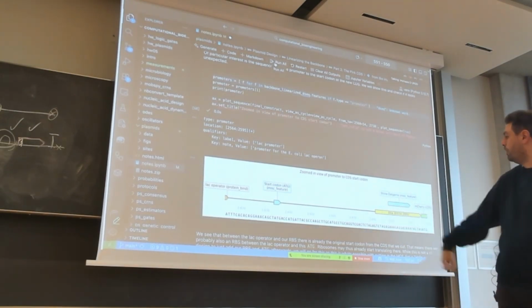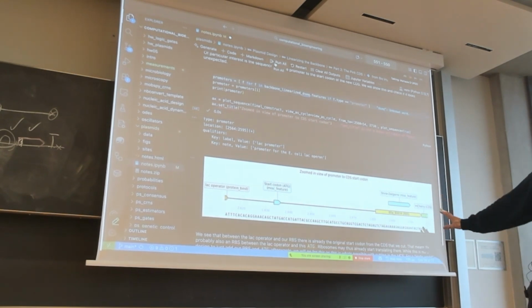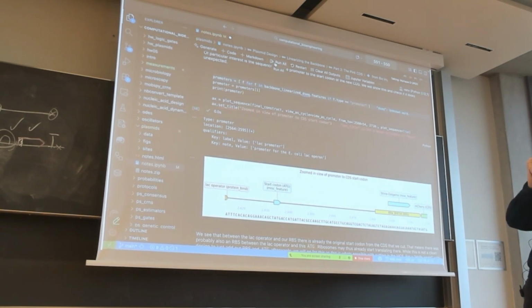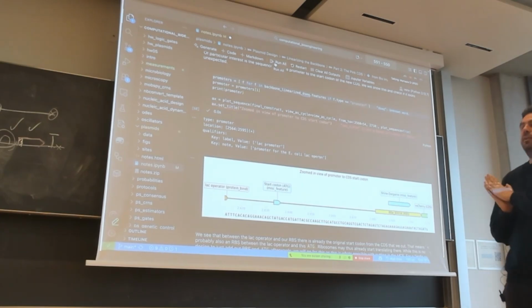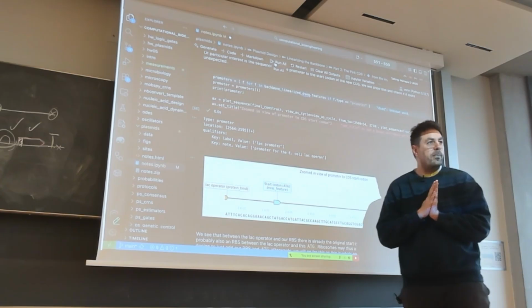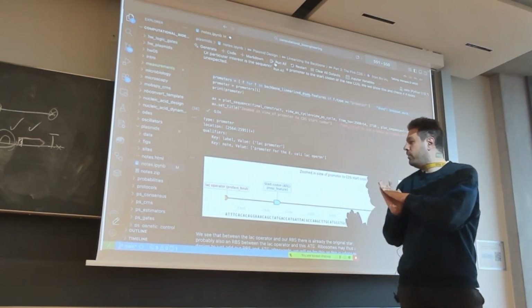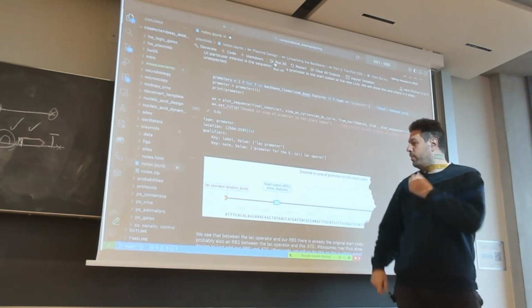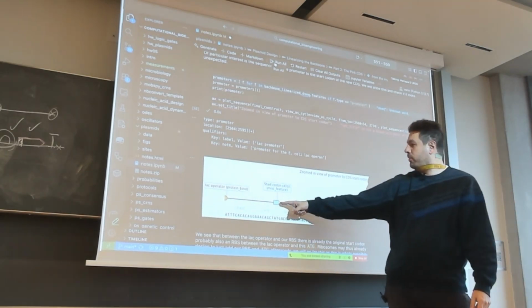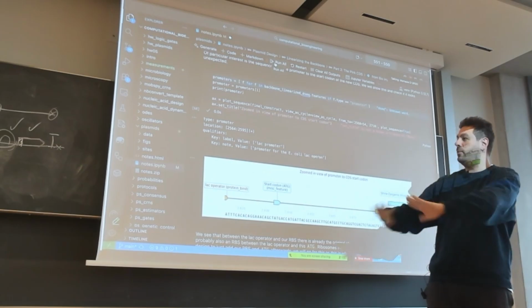Okay, so this is our construct where we zoomed in, and everything looks fine. There is a little not-nice thing, but that was on purpose for a Hello World example. We were a little bit cheating, and this is the reason why I kept that in from the beginning. We have the start codon of the original sequence that we have now cut in the middle.